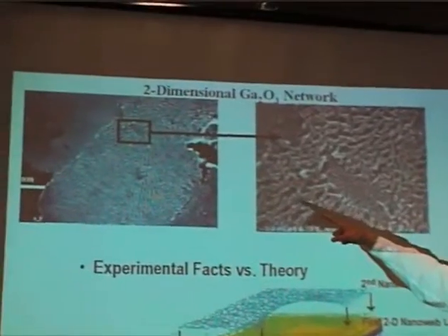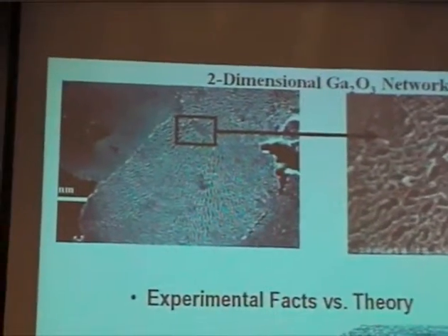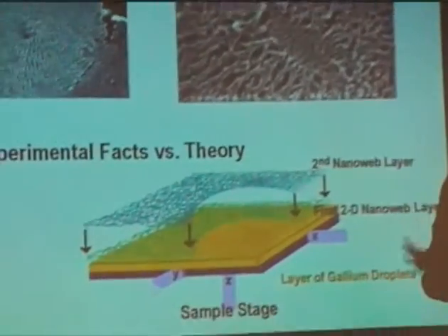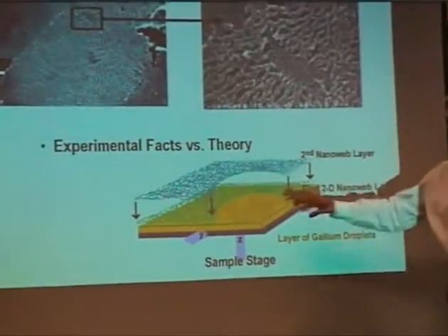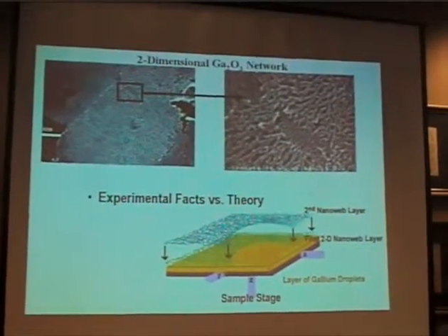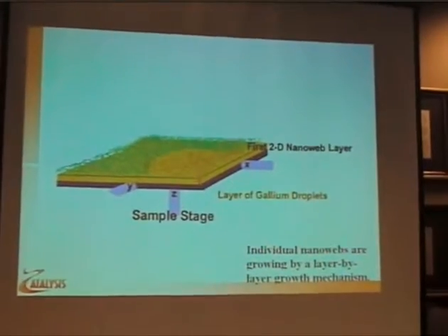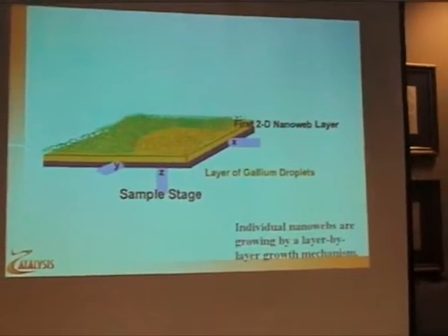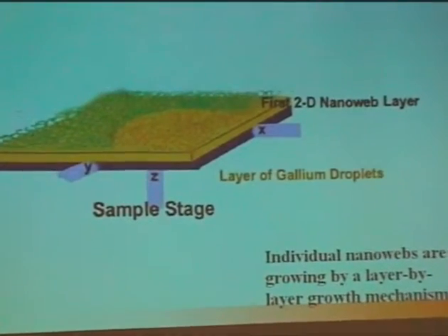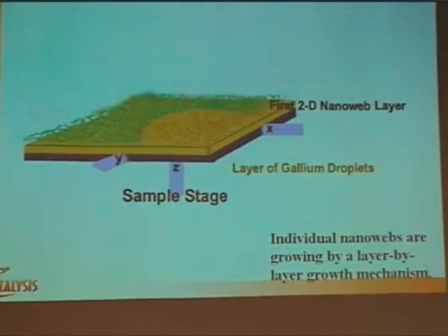This is a SEM right here and over here of a nanoweb. And we're really clumsy at the moment without this 3D model, trying to visualize how this 3D system can be applied at the nanoscale. I'll show you what we've been able to do until now, and then Eric will surprise you with what's able with this model.